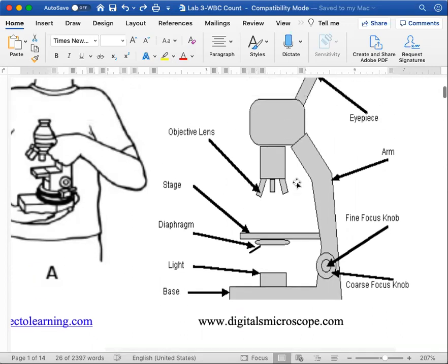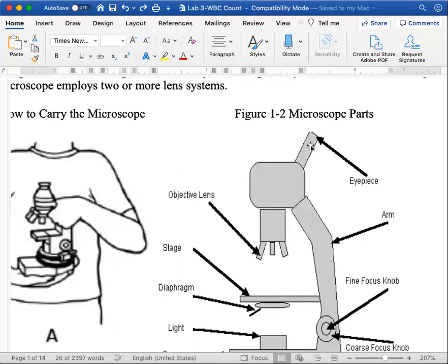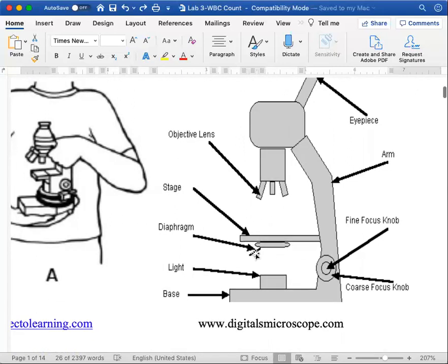The trick with microscopes is that you have two eyepieces which magnify your sample tenfold, and the objective lenses magnify at 10x, 40x, and 100x. The eyepieces are like binoculars so you can adjust them to fit the width of your eyes. The left eyepiece has the ocular focus to get your left eye into focus. There's also a little iris diaphragm lever underneath the stage — turn it clockwise to close it and add contrast so cells pop out better, or open it to let more light through. There's also a dial for the light.